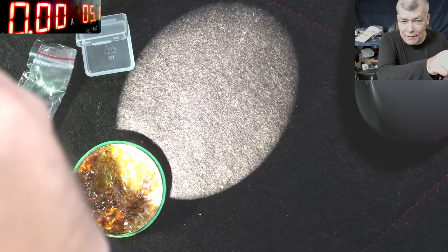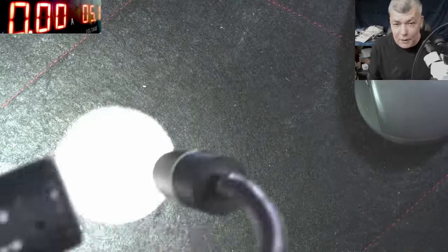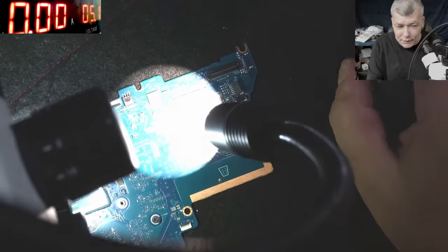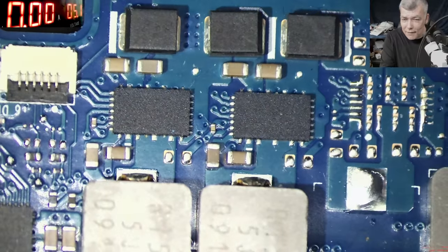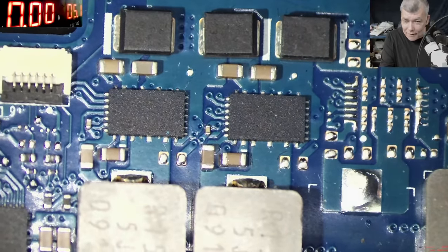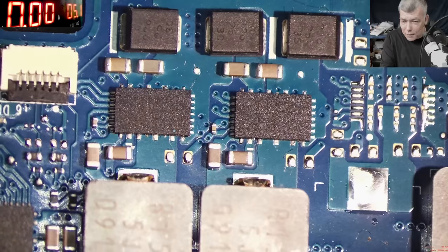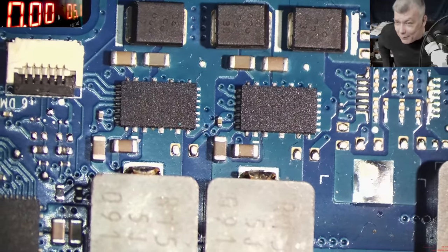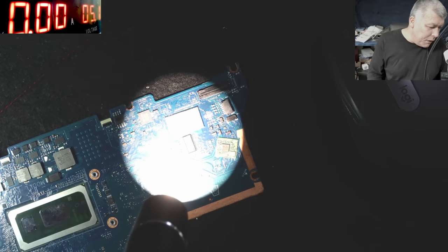Now let's raise the current. Wow! Let's compare them — not sure if you can see. So that's the one, and that's the other one. On the microscope: that's the original one, and this is the new one. Original, and the new one. It's kind of a big difference, don't you think? Clearly it is getting hot — we're near 2.2 amps. So I'm going to replace the other one. I don't want to use them at their full potential, so I'm not looking for a bigger charger — but they have better efficiency. For the current they're drawing, they're outputting more light.